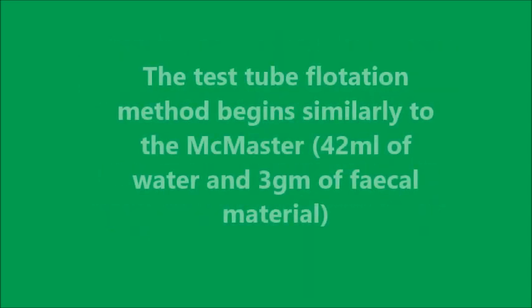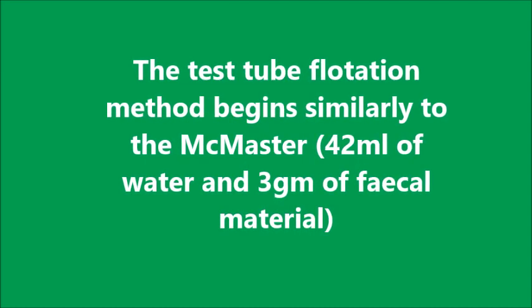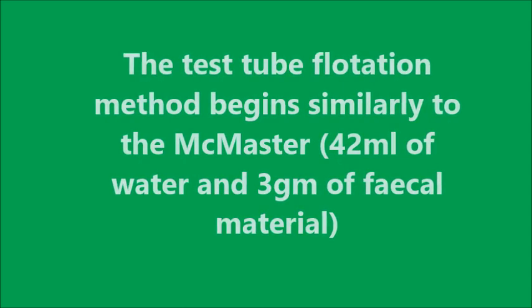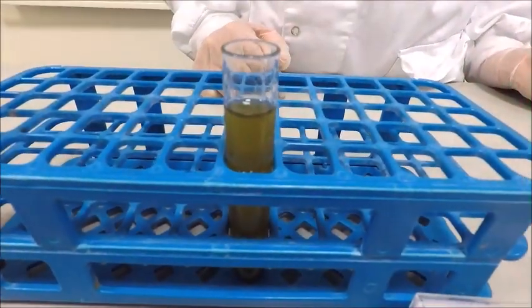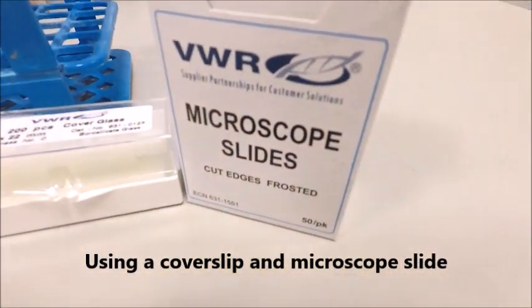The test tube flotation method uses the same steps as the McMaster: 42mL of water and add 3 grams of fecal material. But instead of using a chamber, we simply float in a test tube. Taking a cover slip and a microscope slide, use the remainder of your fecal suspension and simply top up with sodium chloride.